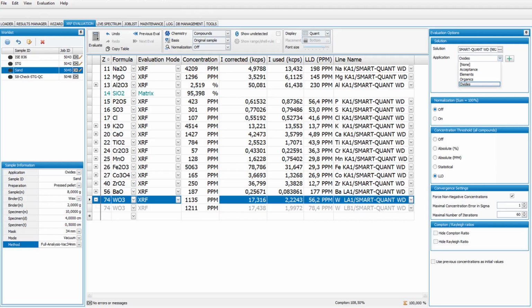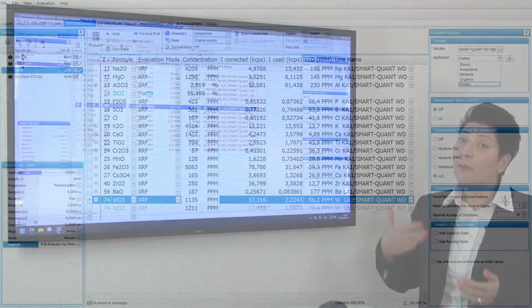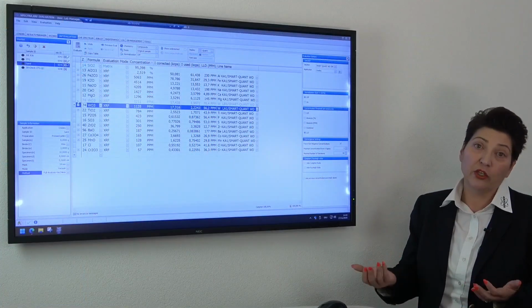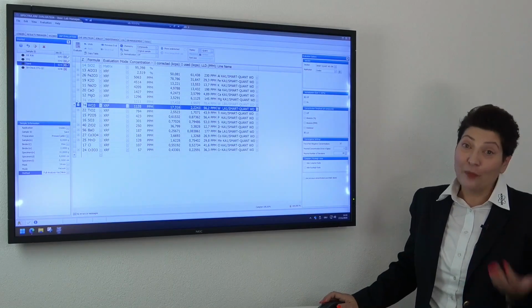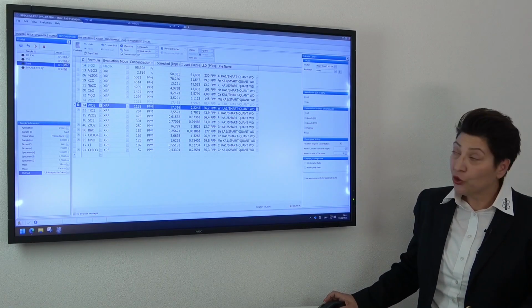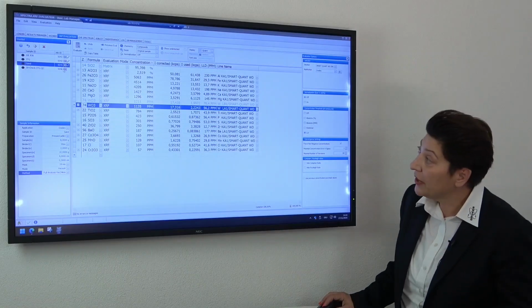Typically quartz samples have quite a long grinding time. So with the standardless software, you can also check for other elements which are not part of your calibrations, or maybe some contaminants which you would not even expect in the sample. If you have more complex samples, even with lower traces, I have another example here.